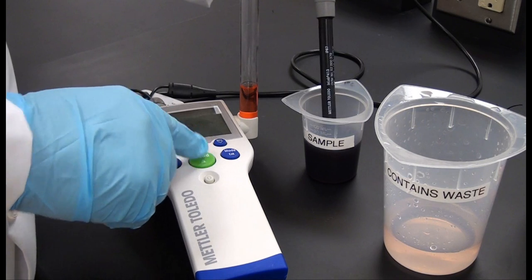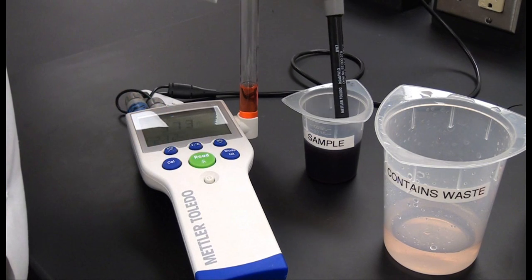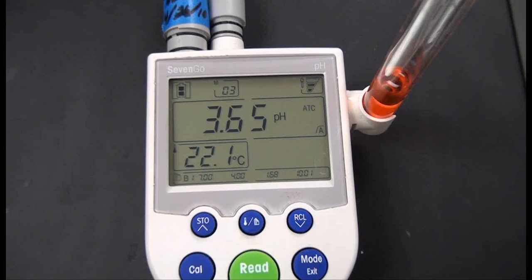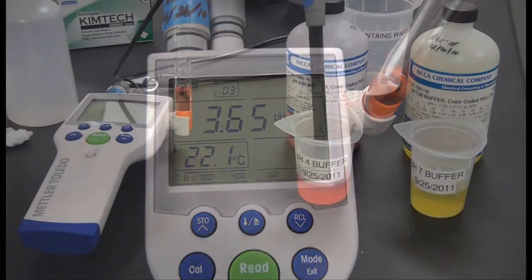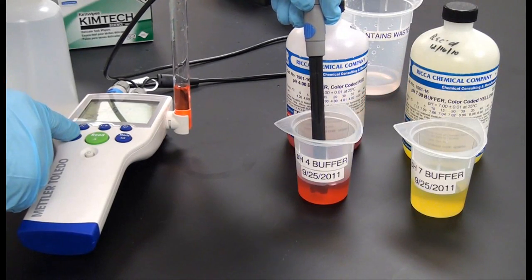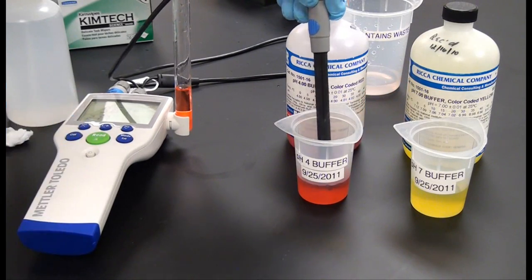The pH meter is used to measure the acidity or alkalinity of a liquid through a probe by reading the reactivity of the hydrogen ions. The 7-go SG2 pH meter allows you to perform 1, 2, and 3-point calibrations.